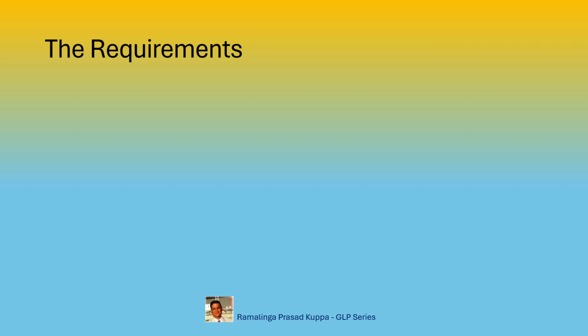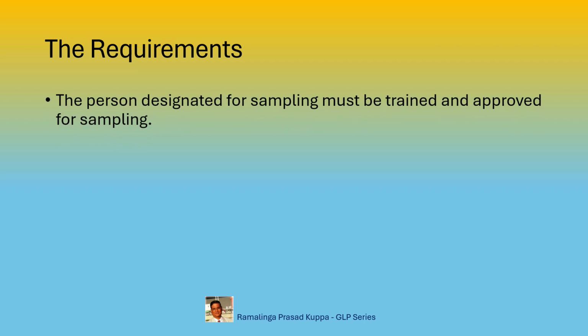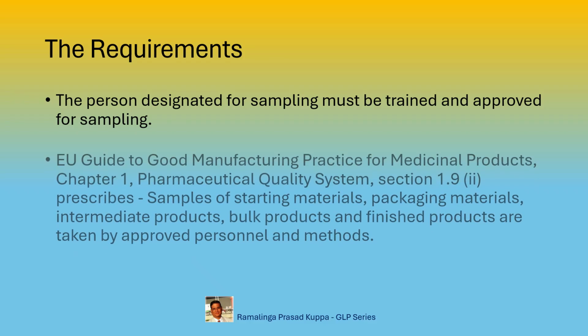Let us see the requirements. The person designated for sampling must be trained and approved for sampling. So the person must be technically fit to sample and be approved by a competent authority.